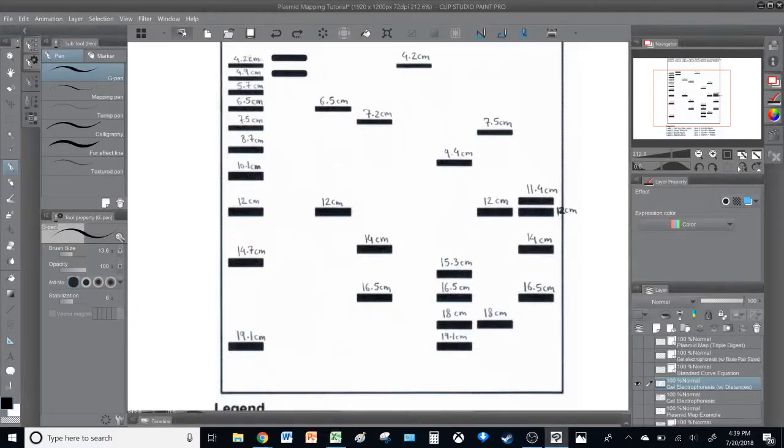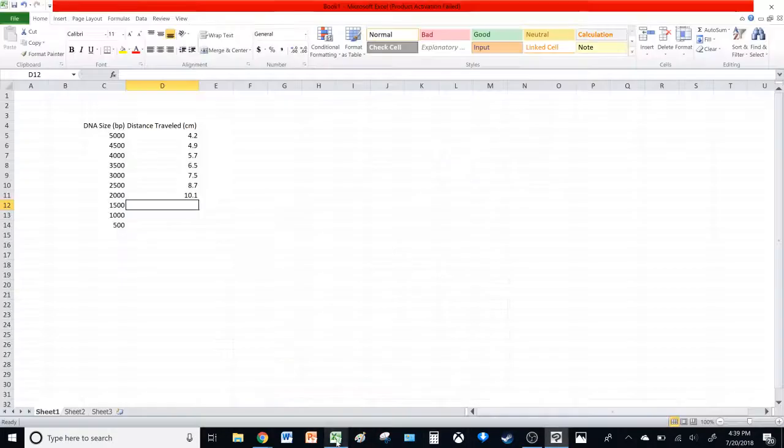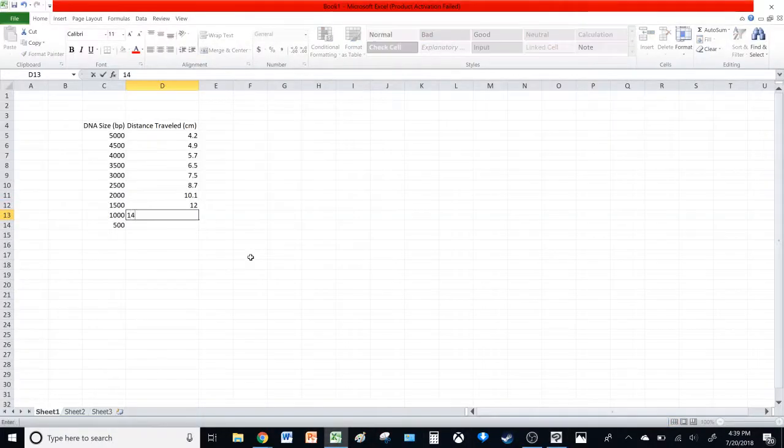This was 12, 14.7, and lastly 19.1 centimeters.